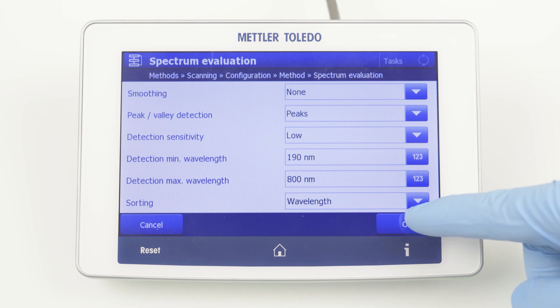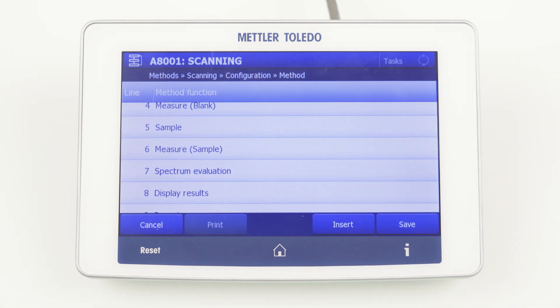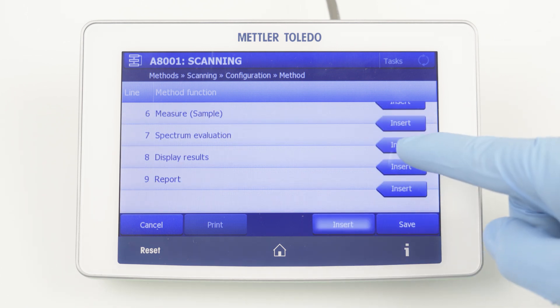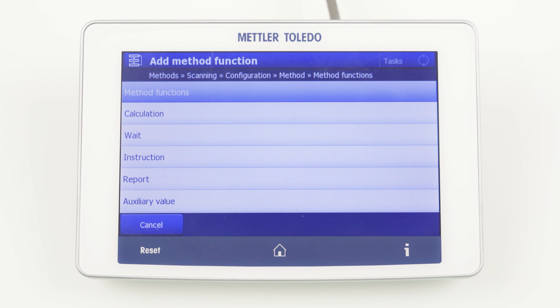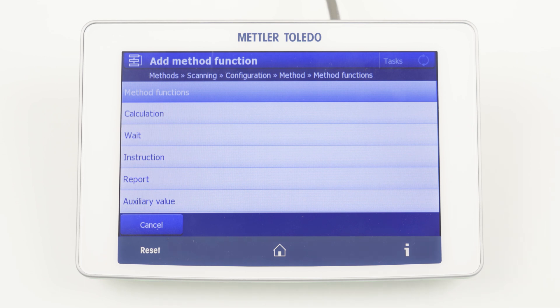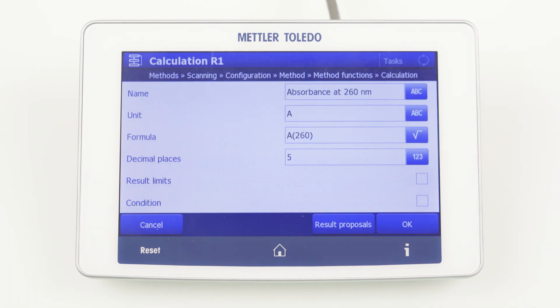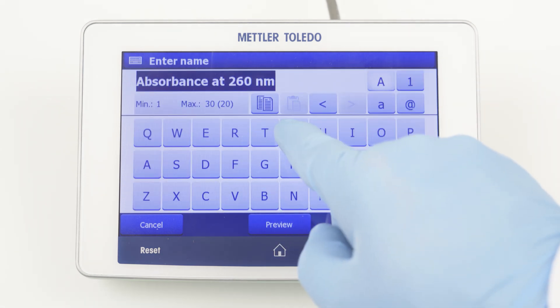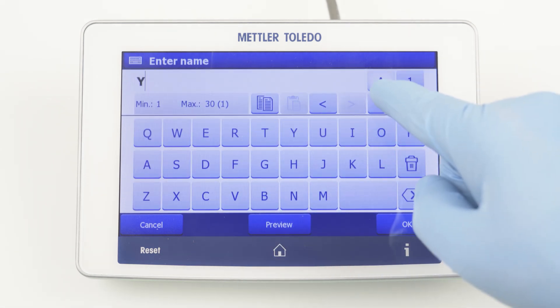To calculate the color number, you have to add the method function calculation by clicking Insert. The calculation can only be added after spectrum evaluation. Now we can define the name: Yellowness Index.